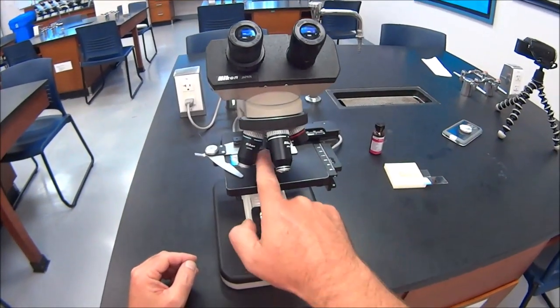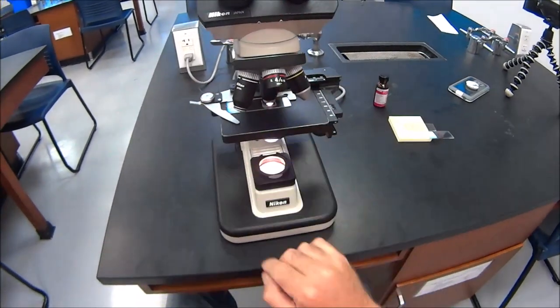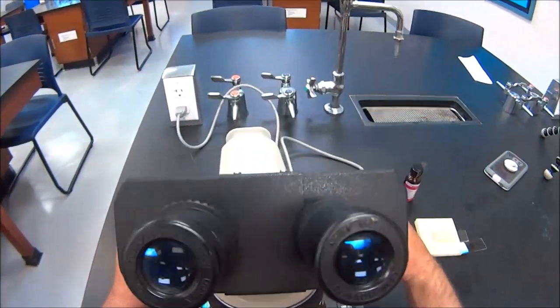Now that we've got it in focus at 10, we go up to the next lens, which is 40. So we're going to get that in focus. At 40x objective lens, you're starting to see the bacterial cells as little red hair-like lines.